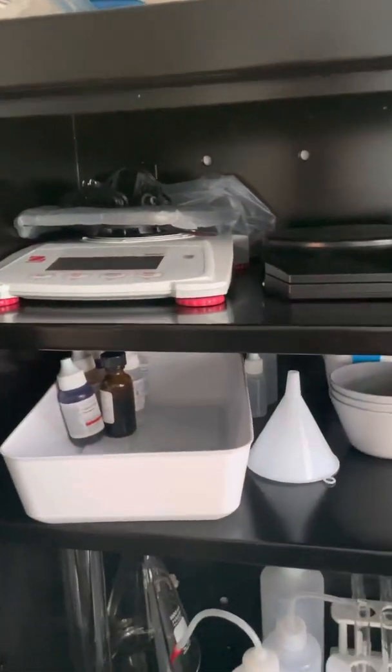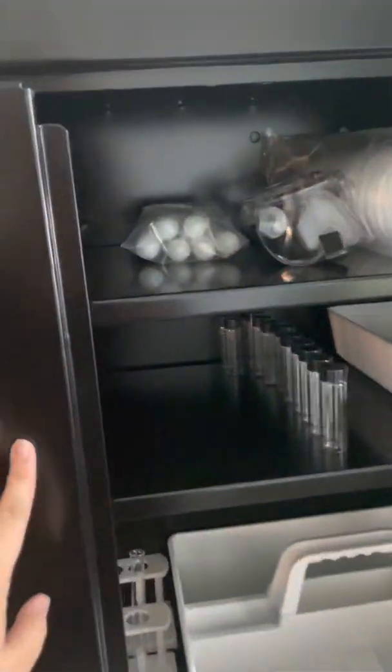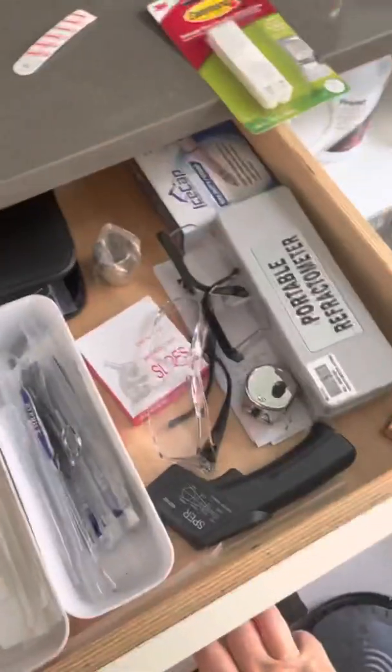So that's basically the lab. I have some little calipers and scales and whatnot. There's also a refractometer here, which measures the salinity and specific gravity.